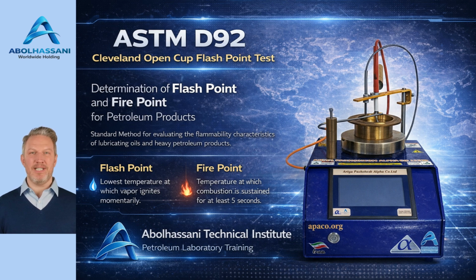Introduction to ASTM D92. ASTM D92 describes the Cleveland Open Cup method for determining the flash point and fire point of petroleum products. According to ASTM D92 Section 1, Scope, this test method is applicable to petroleum materials with flash points typically above 79 degrees Celsius. The procedure measures the temperature at which vapors above the sample ignite when exposed to a test flame. This method is widely used in petroleum laboratories to evaluate flammability and safety characteristics of oils and heavy petroleum products.